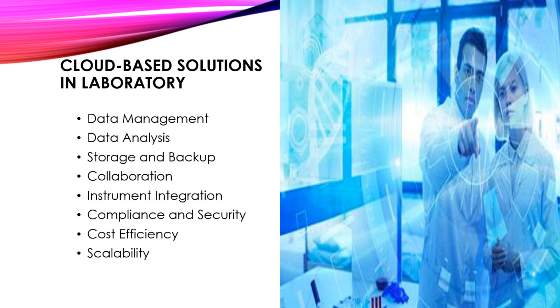Data analysis. Cloud-based platforms provide powerful computational resources for data analysis, including bioinformatics, genomics, proteomics, and other scientific disciplines. Now, researchers can leverage scalable computing resources to analyze large data sets quickly and efficiently without the need for expensive hardware investments.